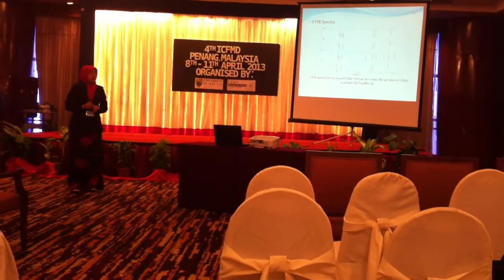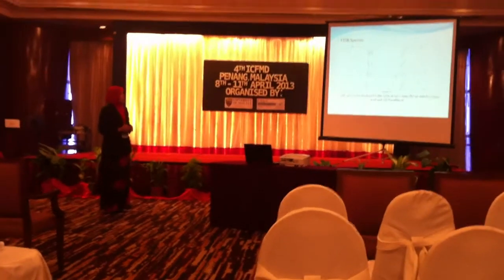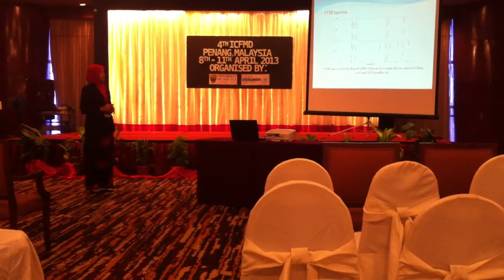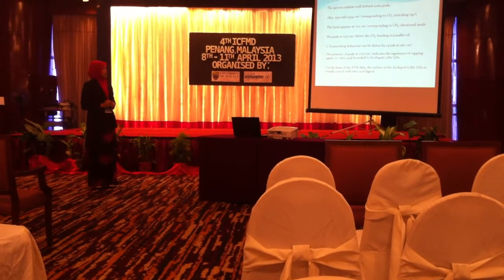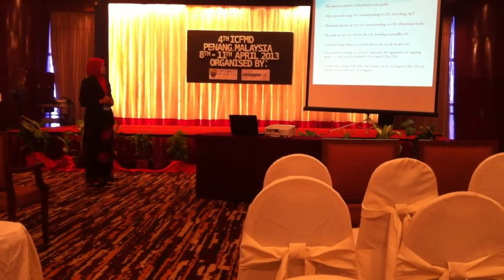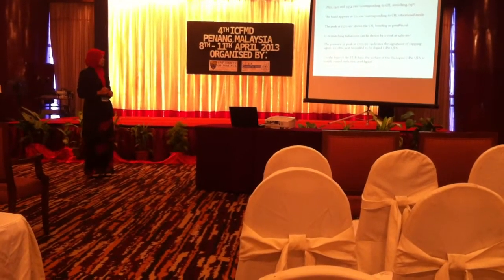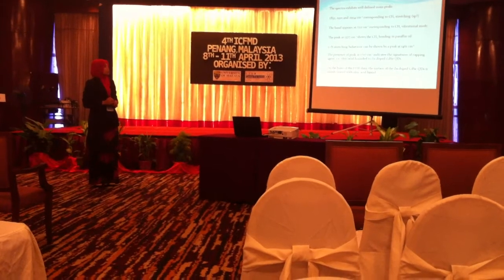Okay, the next one is FTIR spectra. Here for 0 minute, 90 minute, oleic acid and paraffin oil. The spectra exhibit well-defined main peaks, and the peaks at 2852, 2921, and 2954 correspond to CH2 stretching. The band at 722 corresponds to CH2.